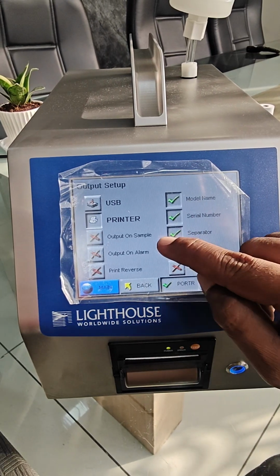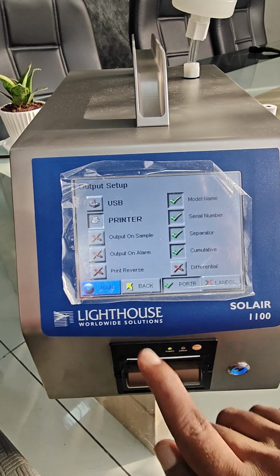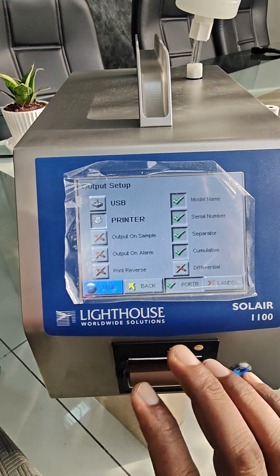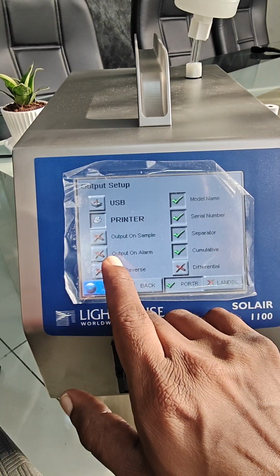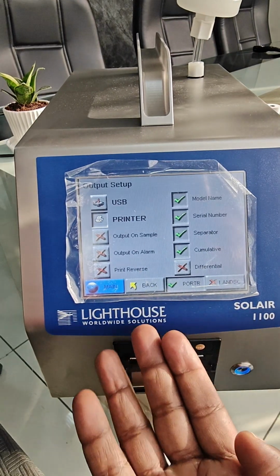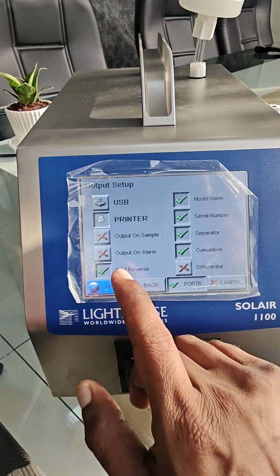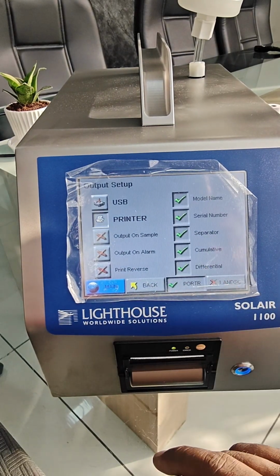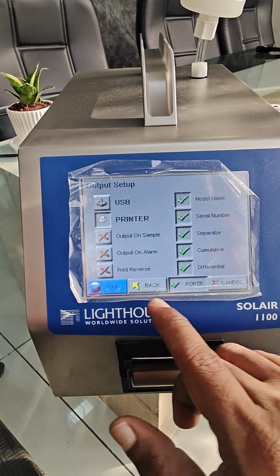Whatever you want, if the sample is completed and you want printout, enable it on sample, otherwise disable it. If you want output on alarm, when there is an alarm, you can have alarm printout. You want the printout this way or in this way, then you have to select print reverse directions. You want differential count also, you can have a selection of this.